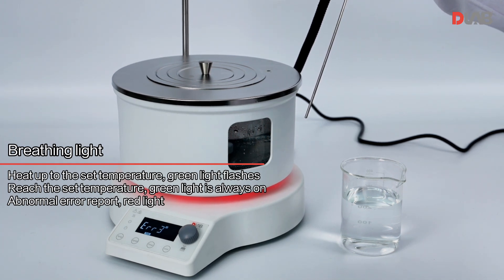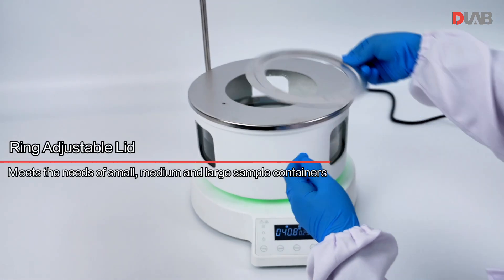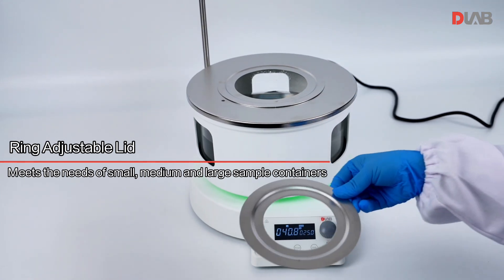Ring adjustable lid meets the needs of small, medium, and large sample containers.